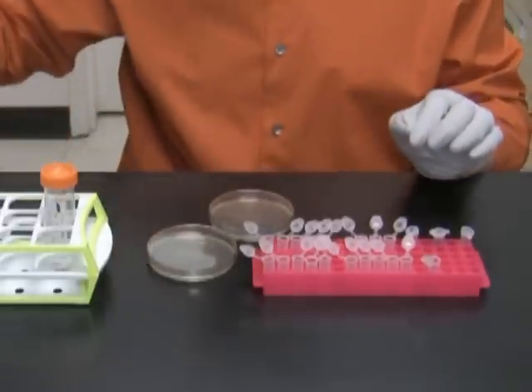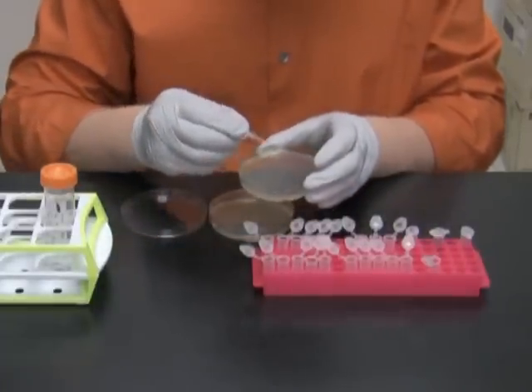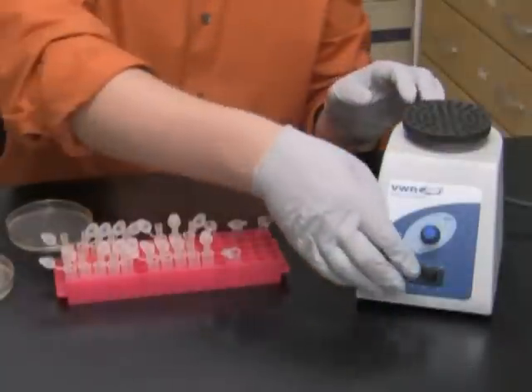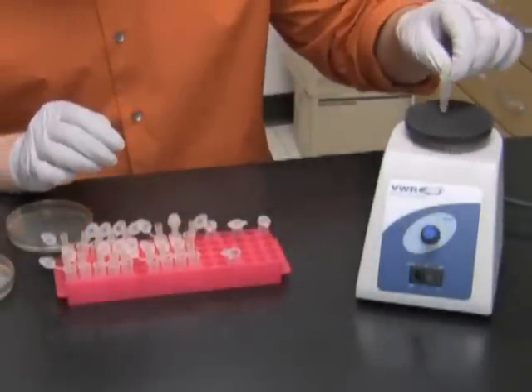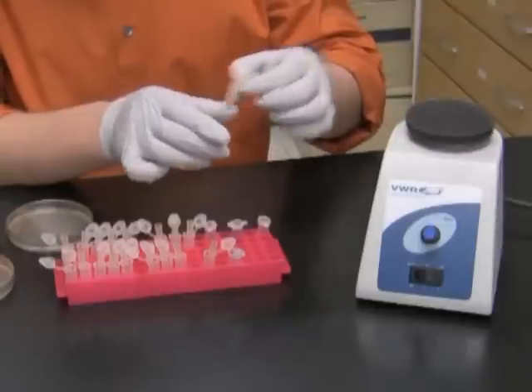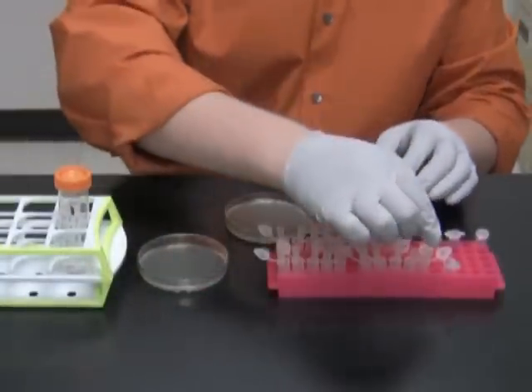In the rest of the tubes I will transfer the colonies by picking them with paper tips, dipping the tips in the tubes with 20 microliters of water, and leaving them in the tubes for the moment. Once all the tips are in the corresponding tubes, I shake off the cells by vortexing the tubes at low speed with the tips inside. Then I remove each tip and touch the labeled replica plate.